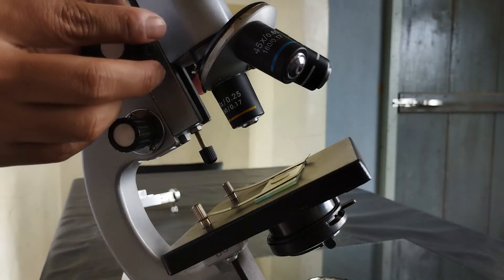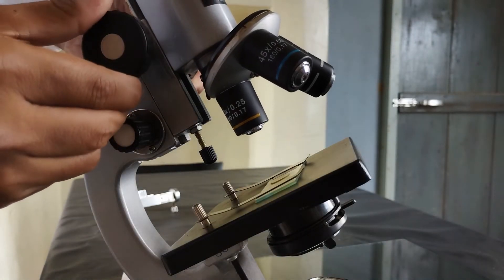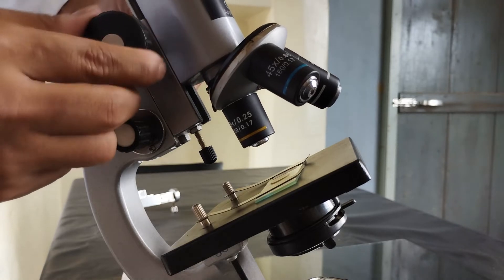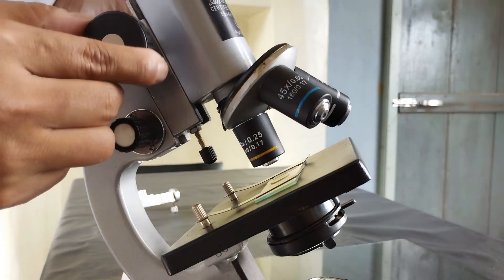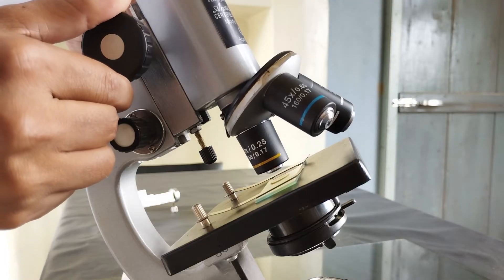Once you have centered the specimen, slowly and carefully lower the objective lens using the coarse adjustment knob until it almost touches the surface of the slide or the cover glass.